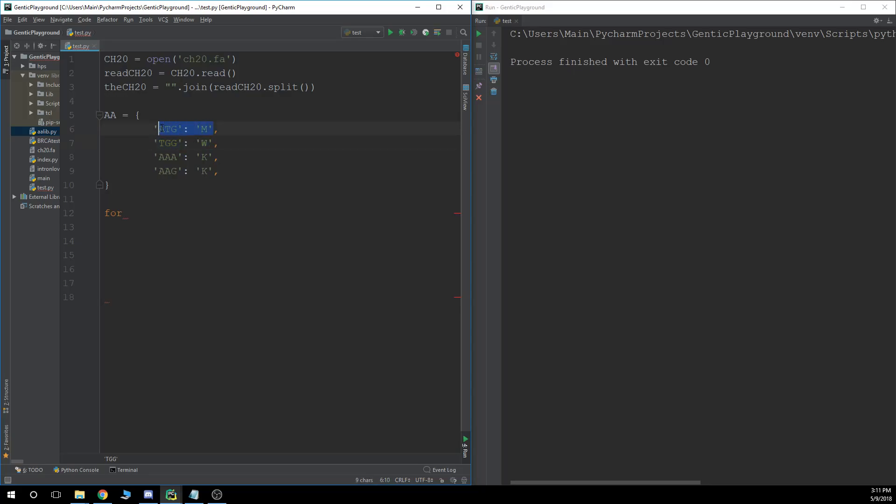The reason why we're using methionine here is because methionine only has one option. That's why I picked methionine and that's why I'm picking tryptophan here, because methionine and tryptophan, they're the go-tos when you're trying to make a probe. Don't think that this is anything different than making a probe because we want to look for sequences that only have one possibility.